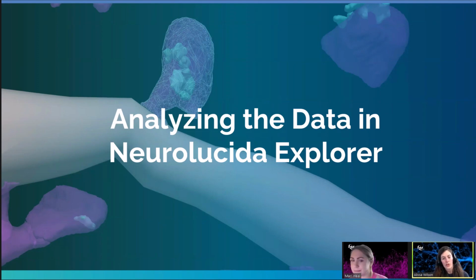Those new tools are great, and I'm especially excited for people to check out the surface feature. So now that we have all of this, to get here we utilized our large data management tools that allowed us to easily reconstruct the objects within our volume of interest. And so now we want to extract quantitative information about this morphology to answer our various experimental questions. We can do this using our many analyses in Neurolucida Explorer.